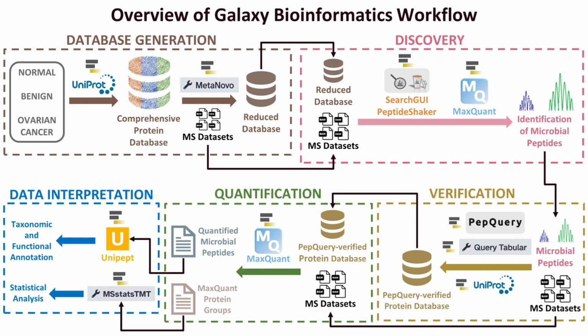I do want to point out that the Clinical Metaproteomics tutorial includes all 5 modules. I mention this because each module has its own workflow link that we will import. While we can create a giant workflow to contain all of these modules, creating a separate workflow for each module makes it easier to catch errors early on before moving on to the next. So keep in mind that each module has its own workflow, and these workflows together make up the Clinical Metaproteomics tutorial.